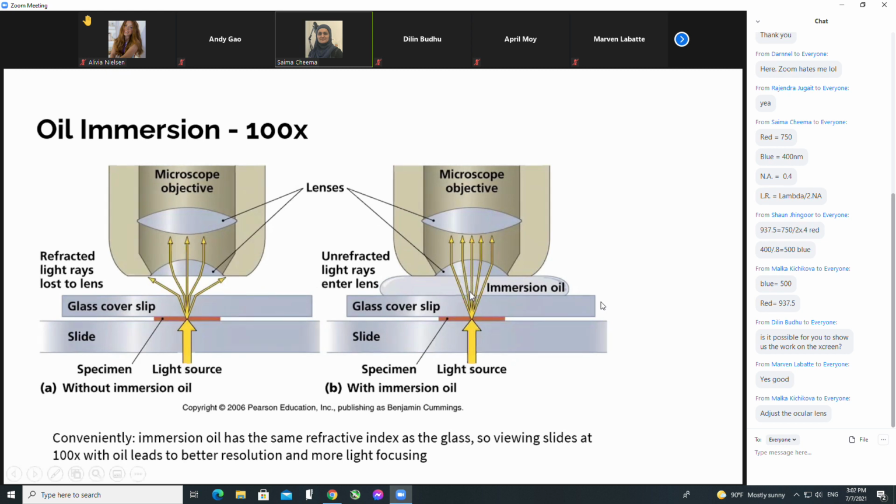You can't have a space because that will introduce another area for light to bend. And that means that the objective lens has to be really cleaned before you leave for the day, unless you want a thin film to add every time, and then a thick deposit to form, and eventually you will lose visibility that way as well.